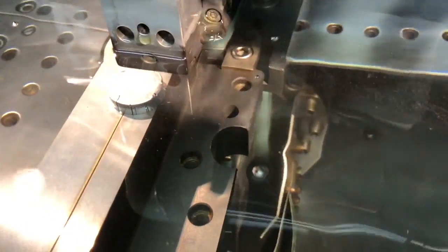This water has a conductivity of only one or two. You can put your hand in it and you won't get shocked, because as we know water is non-conductive, and this is proof right here that it is non-conductive. The whole machine is metal, and if the water were conductive, the person running the machine would be shocked to death. So water is non-conductive.